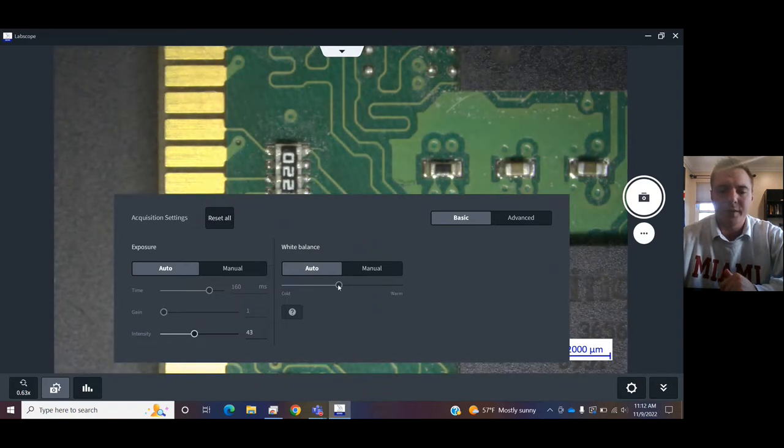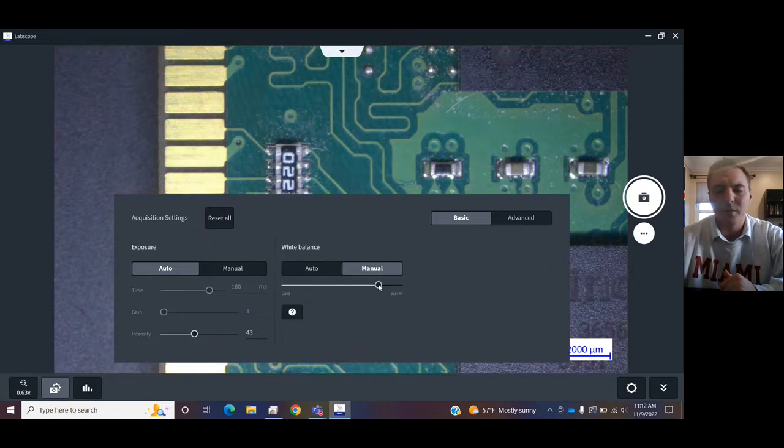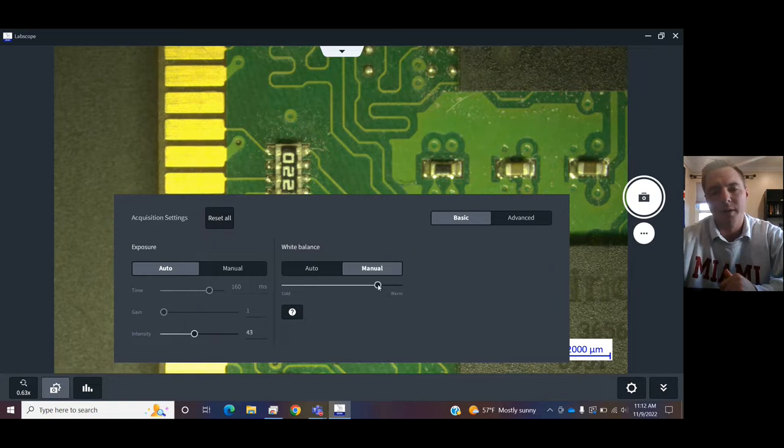Also, set a white balance. That is, make the image appear blue, red, colder, or warmer. Or just have it in the middle for the auto.